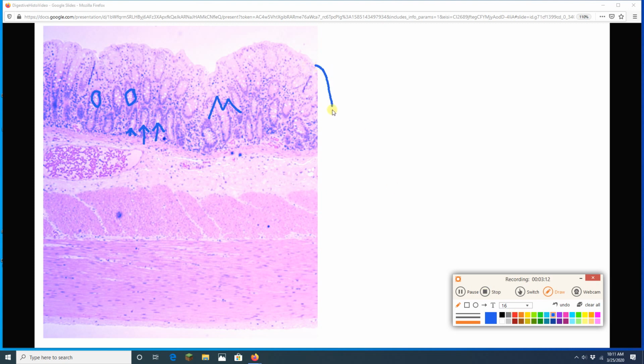What I'm basically in right here, this is basically epithelium and lamina propria. Right underneath that, this stretch right there is the muscularis mucosa. Now, I see the submucosa. I see a big blood vessel inside it right here, which is a really nice vein.